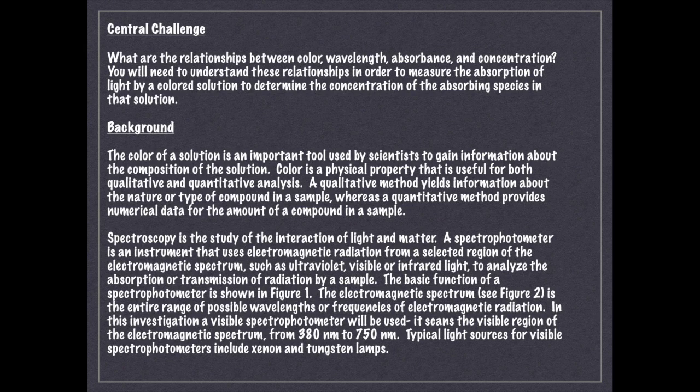The color of a solution is an important tool used by scientists to gain information about the composition of the solution. Color is a physical property that is useful for both qualitative and now quantitative analysis. A qualitative method yields information about the nature or type of a compound in a sample, whereas a quantitative method provides numerical data for the amount of a compound in a sample.